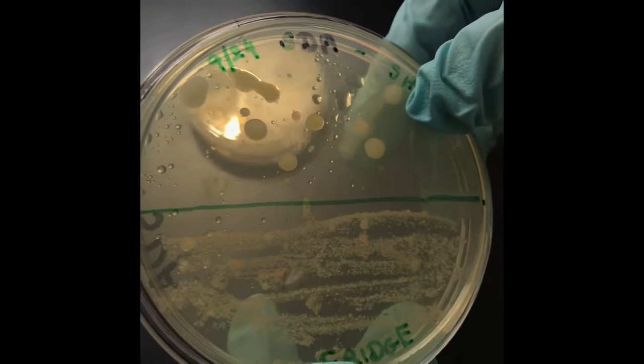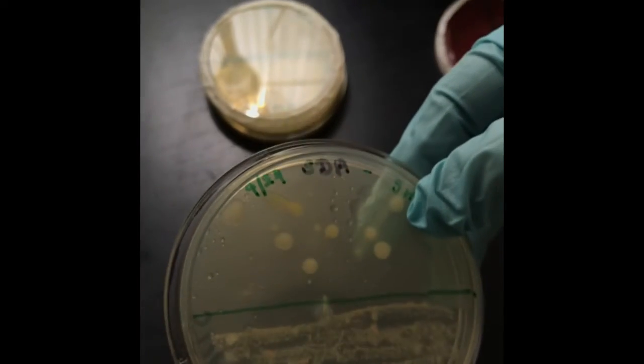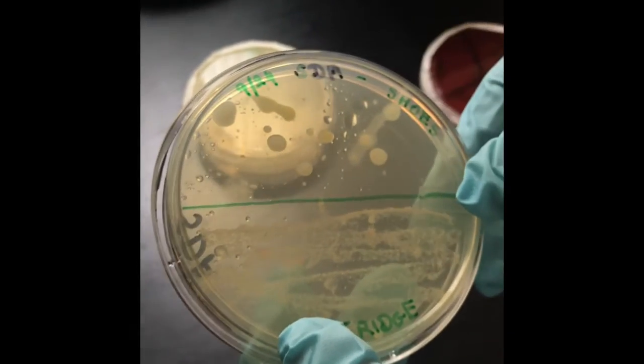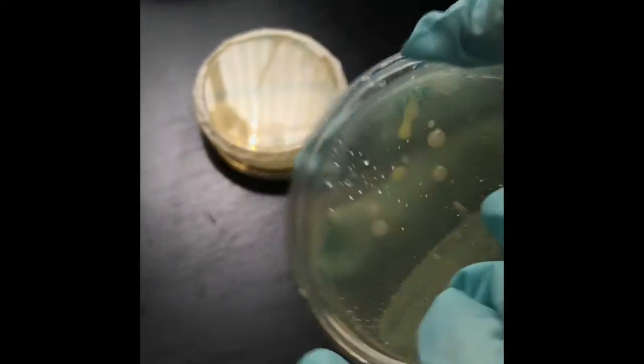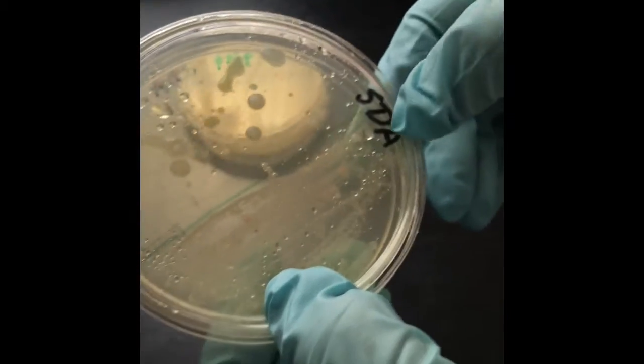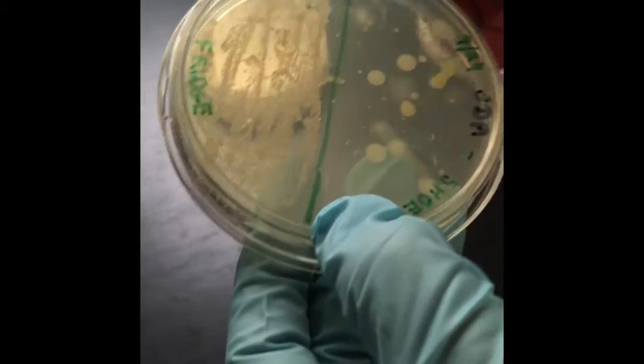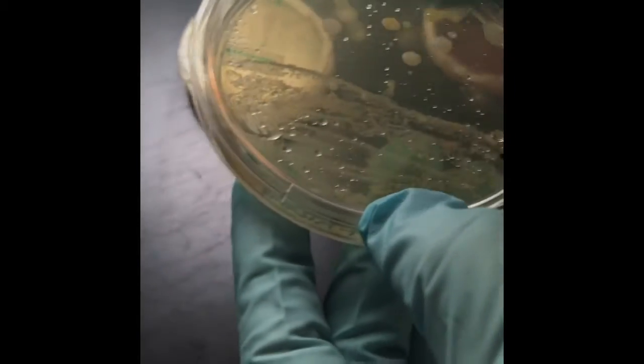This is the SDA plate. Always remember that the writings are on the edge, not over here or on the top. This is written by the staff over here, but we should not write anything on the top so that we can see the growth of the colonies clearly.